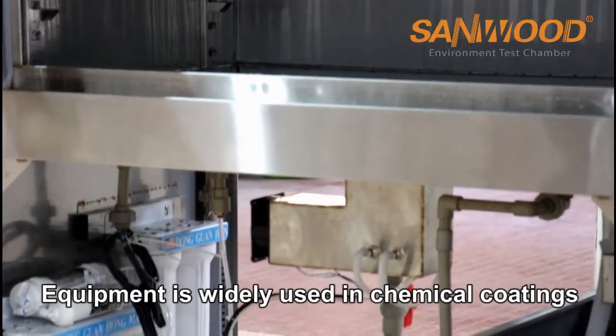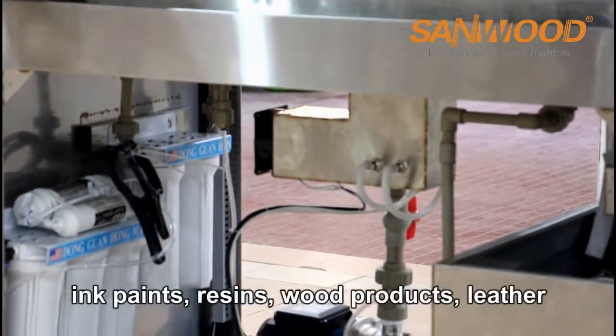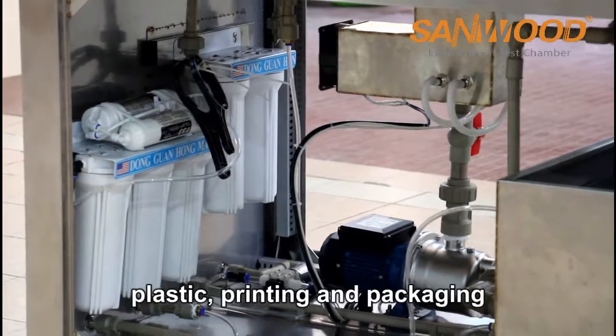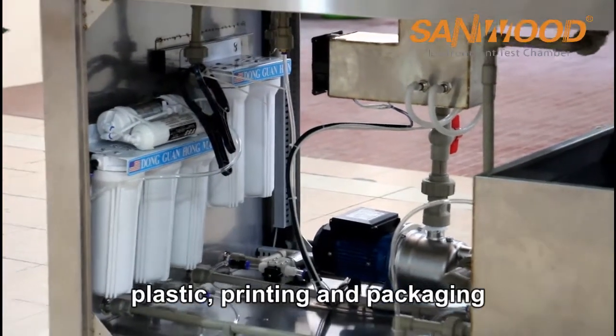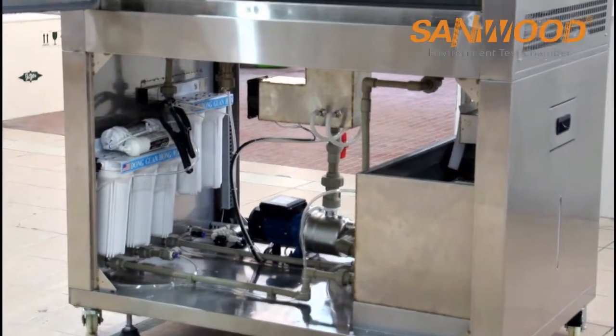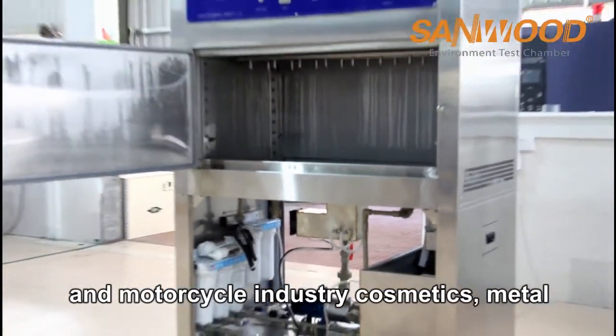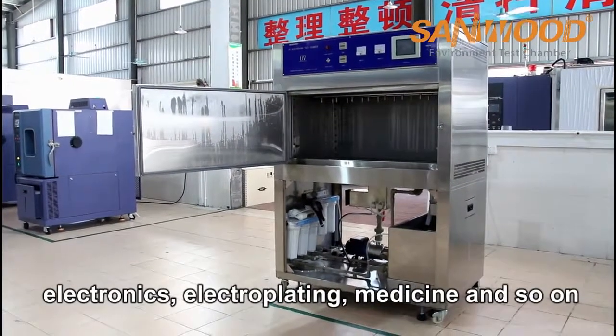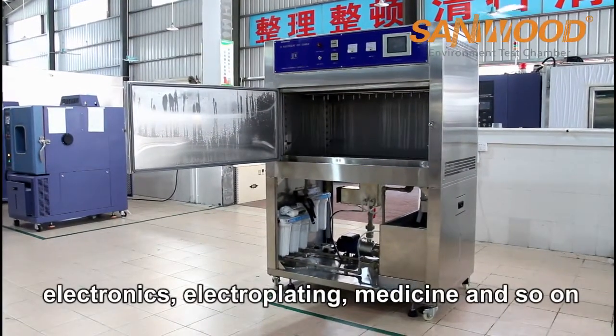The equipment is widely used in chemical coatings, ink paintings, resins, wood products, laser, plastic, printing and packaging, aluminum, adhesives, automobile and motorcycle industry, cosmetics, metal, electronics, electroplating, medicine, and so on.